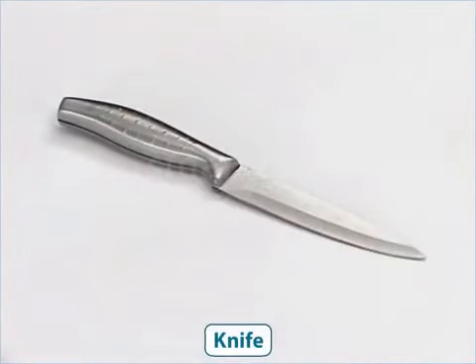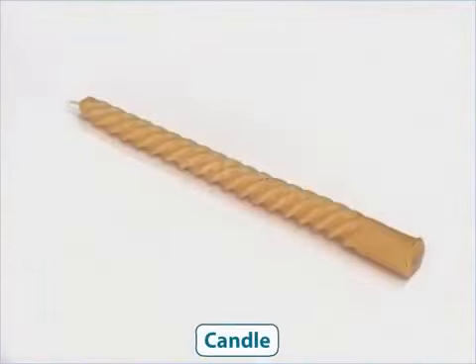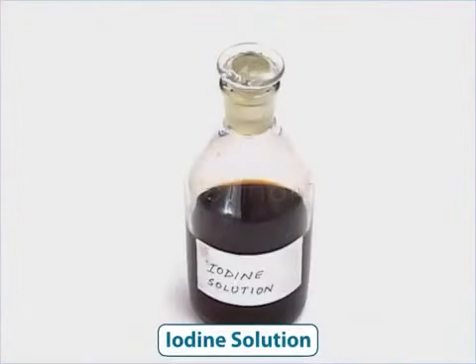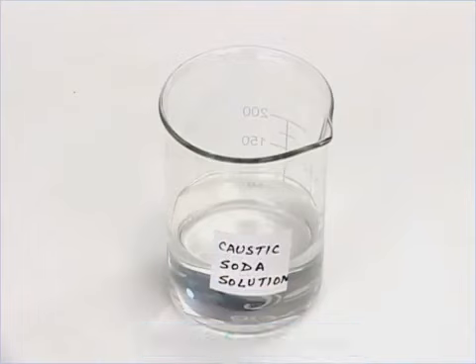a knife, a dropper, a candle, a matchbox, test tubes, iodine solution, copper sulfate solution, caustic soda solution, and water.